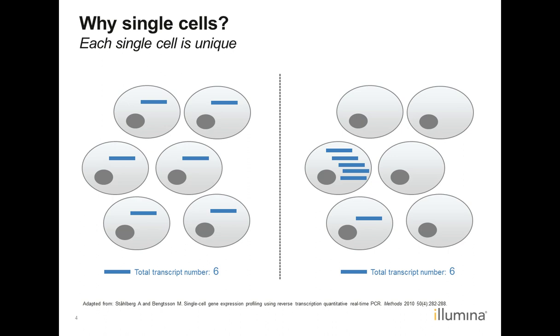In case A, all cells express the blue transcript to a certain extent, whereas in case B, most of the cells are silent, being only a few cells that express it to a very high level. So having single cell resolution, you can actually tease case A and case B apart, and that can show you more about the underlying biology. Like would be the example that we just saw in the cystic fibrosis paper, where instead of the cystic fibrosis receptor being in a common cell type, it may be more confined to a rare cell type that expresses it at higher levels. And this may lead to a very different conclusion.